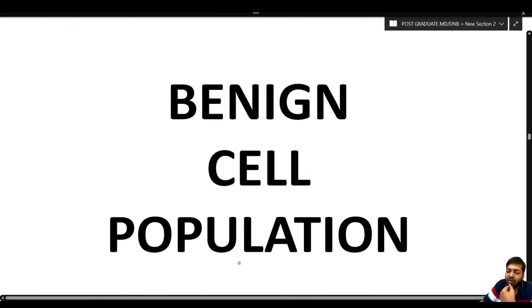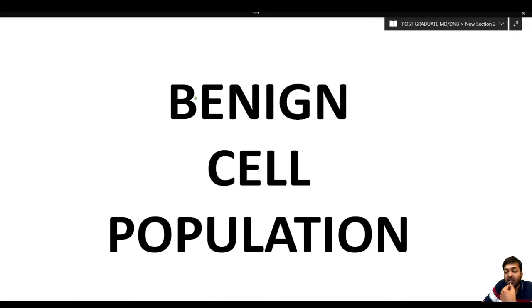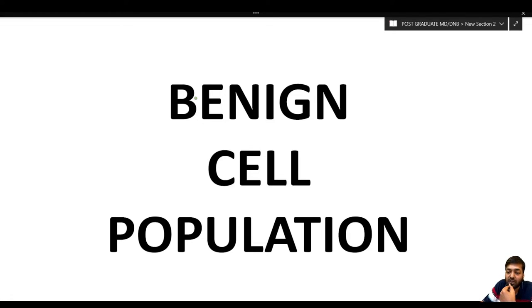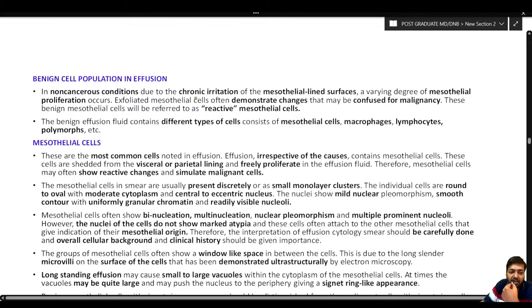Now we begin with the benign cell population. It is very important to understand the normal benign cell population seen in fluid, because 90–95% of the time, the fluid received will be reported as benign without malignancy. Failing to understand this population leads to over-interpretation and mistakes in diagnosis.